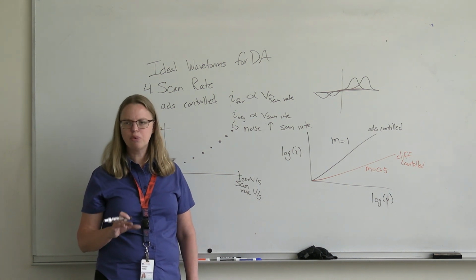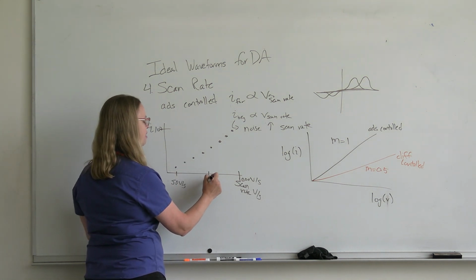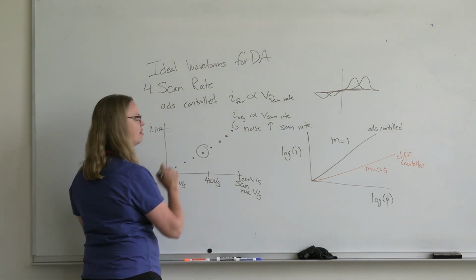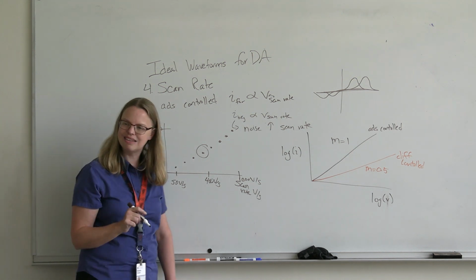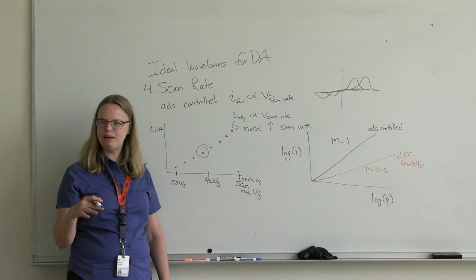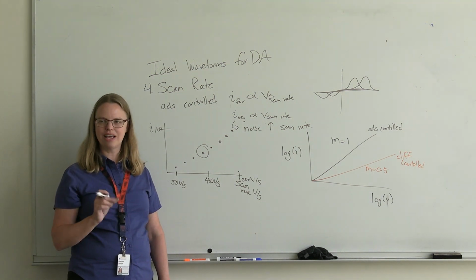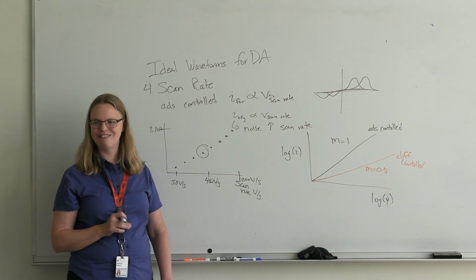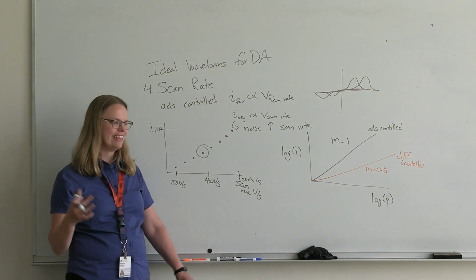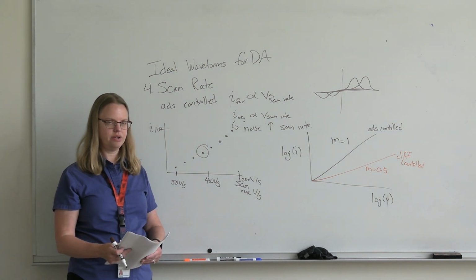But practically, 400 volts per second is probably somewhere down here on my scale, and you're like, well, you're not maximizing. No, we're not maximizing, but it's good enough. It gives us pretty stable signals in vivo. Again, it's sort of funny. It used to be 300 when they got a little bit better amplifiers, et cetera. They sneaked it up to 400. The practical difference probably isn't real large.